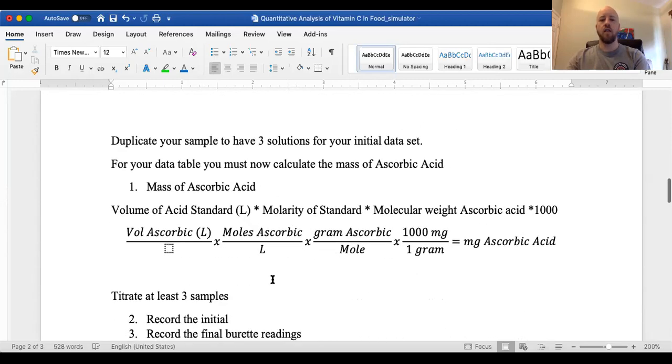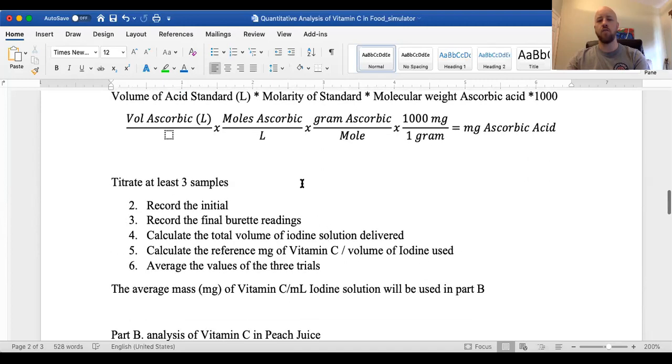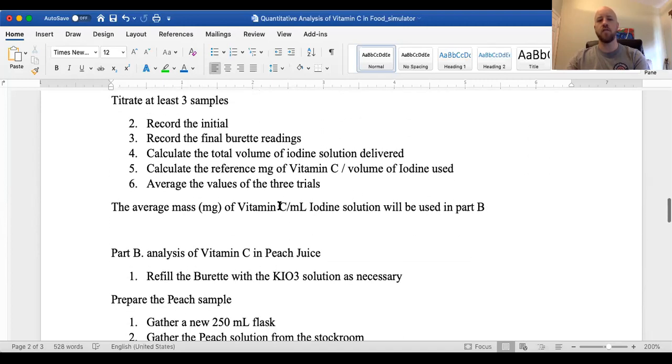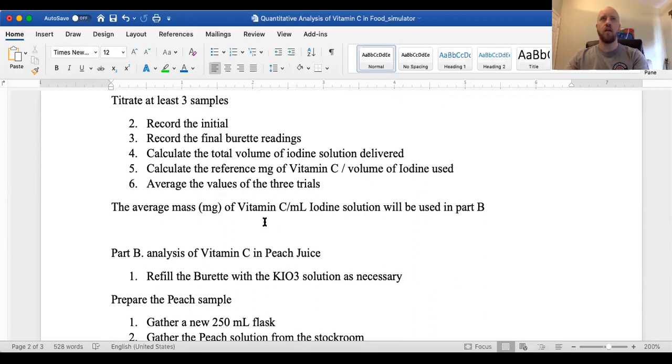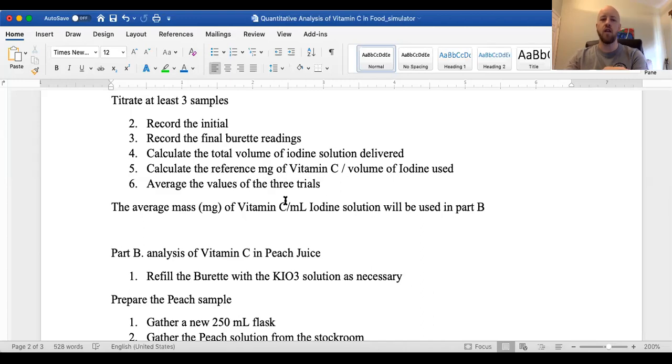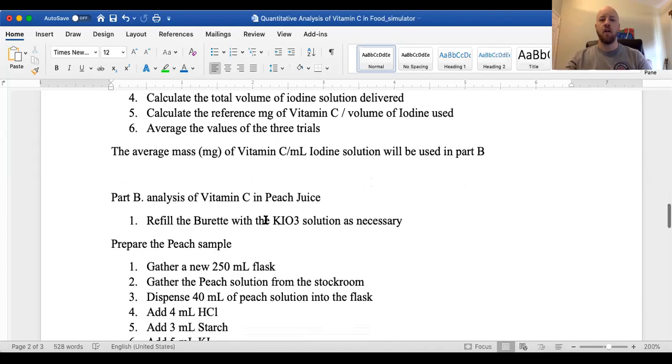And so the calculations are pretty much the same for part A. You'll do at least three titrations. And really what we want to get here is the average vitamin C per milliliter of iodine. So that's essentially going to give our, it's measuring, giving you an idea of how readily your potassium iodate solution responds to the vitamin C. So the different concentrations of your potassium iodate solution is going to give you a different result here. It really depends on the solution that you make, because you're going to get a different response to the vitamin C.